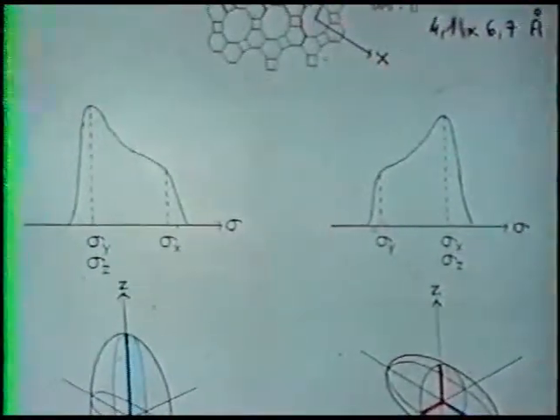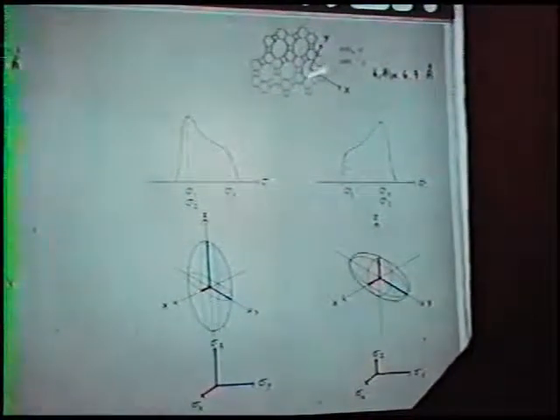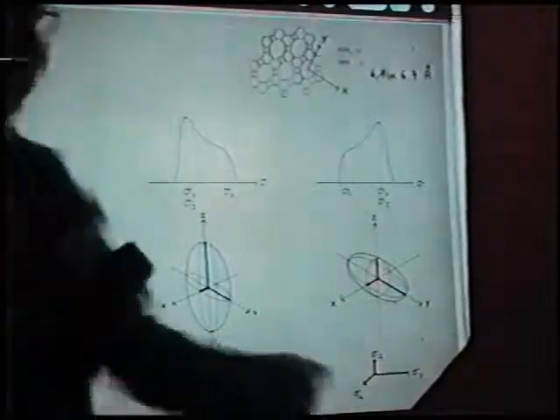On the contrary, if now you increase the xenon concentration, you increase the xenon concentration in the z direction, and so you increase the perturbation in the z direction. And so now you have two permanent perturbations, one in the x direction and one perpendicular in the z direction. On the contrary, in the y direction, the electron cloud is completely free. And so you must change the anisotropy of the chemical shift. And it is exactly what happens.